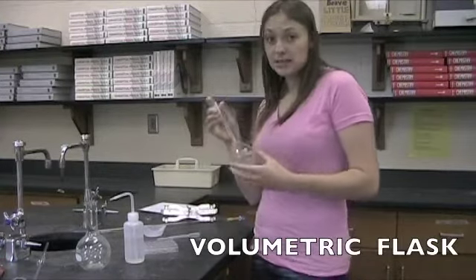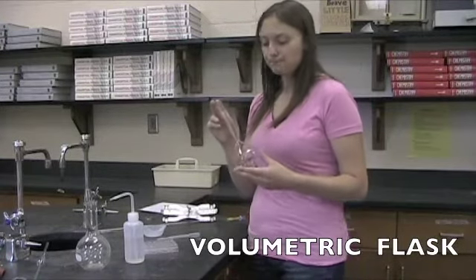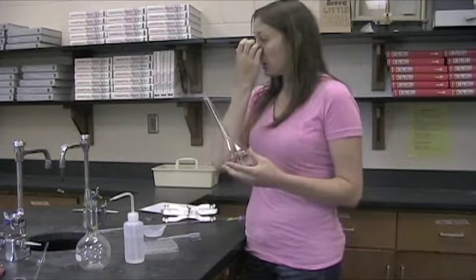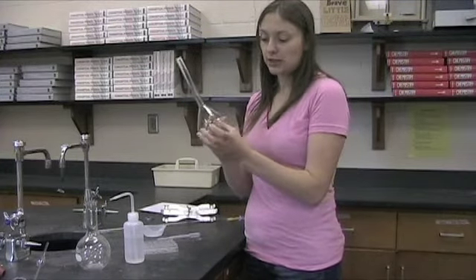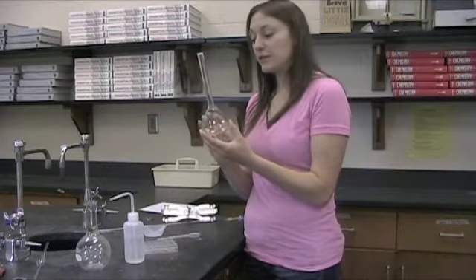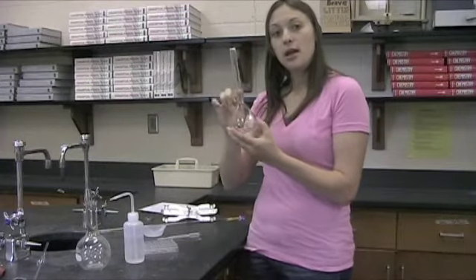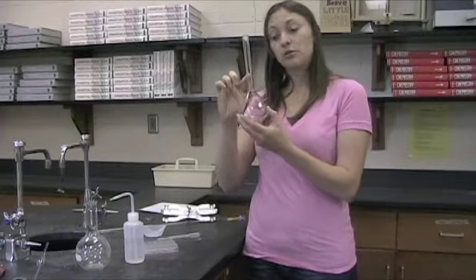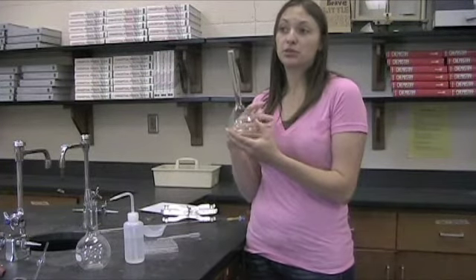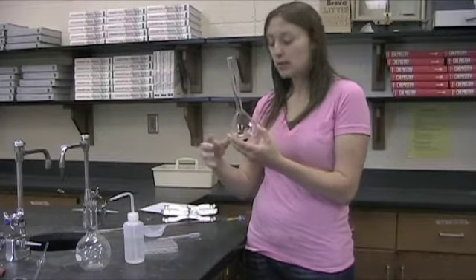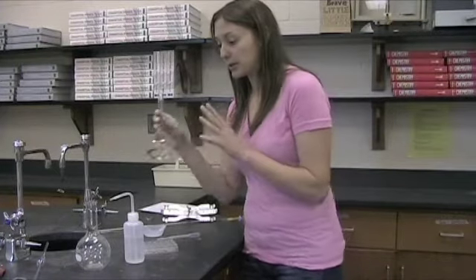I also have what's called a volumetric flask. And we will use these throughout the year. They hold very specific volumes. This one is a 250 milliliter one. It's very similar to the pipette. There's a line on it. And when you fill up with that much solution, right there, that's exactly 250 milliliters. What you do is you make solutions of different concentrations in these. And they hold them. They are very precise and inexpensive.